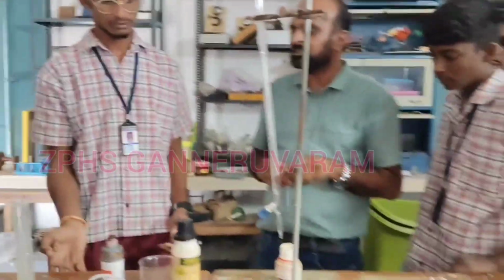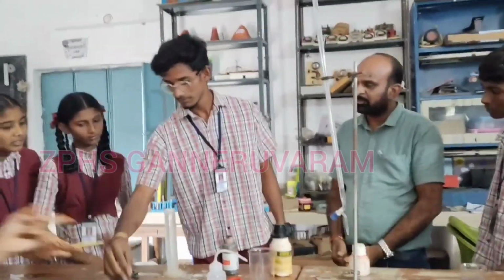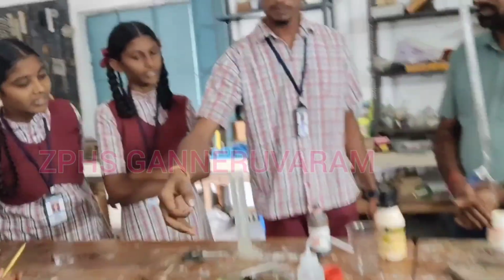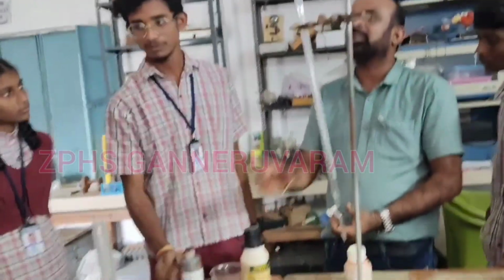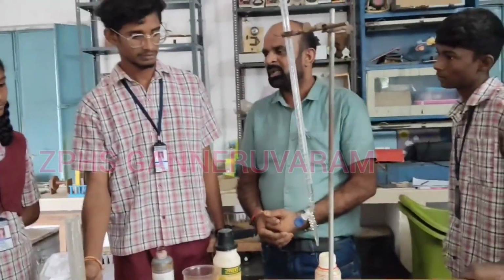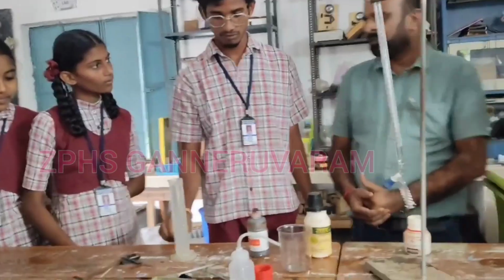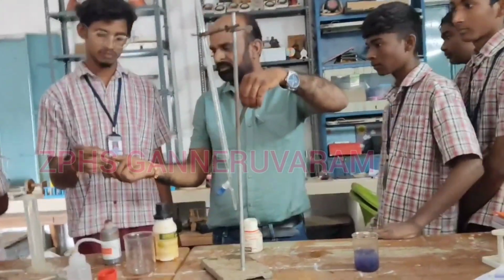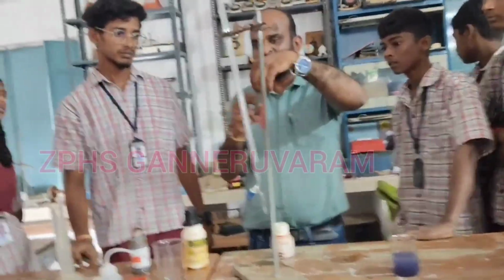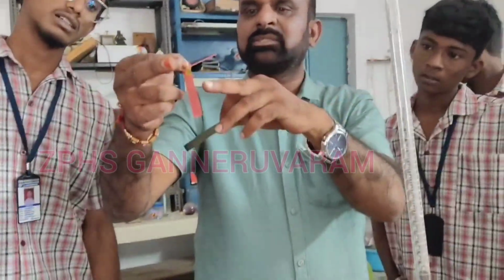Did we use any indicator in this? Yes. What indicator? Red litmus. Paper or liquid? Liquid. This is the red litmus liquid we have used. And also, what papers did we use? Litmus paper. Why are these two colors changed? You observe the two colors. The paper turns to blue color and the red color.